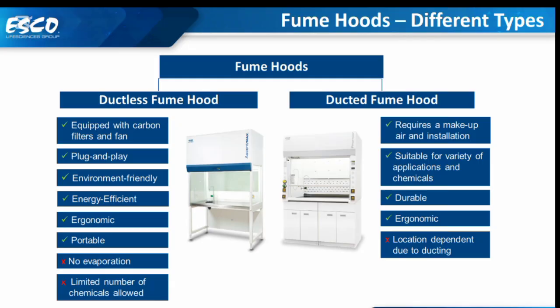So that's the reason when we offer a fume hood, at least at ESCO, we always ask that a form that we call filter check is filled out so that at least we know which correct filters have to go with the ductless fume hood. Because some chemicals are stronger than others.